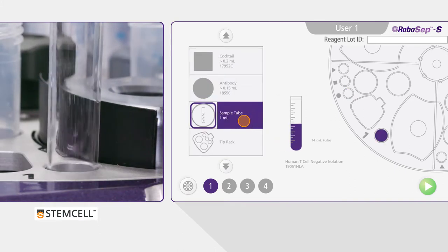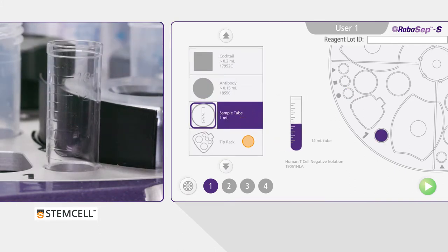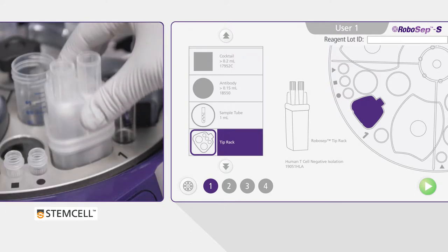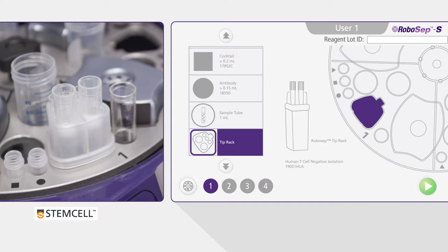Load the sample tube. When prompted for the tip rack, first remove the tip rack cap. Next, fully insert the rack into the appropriate slot.